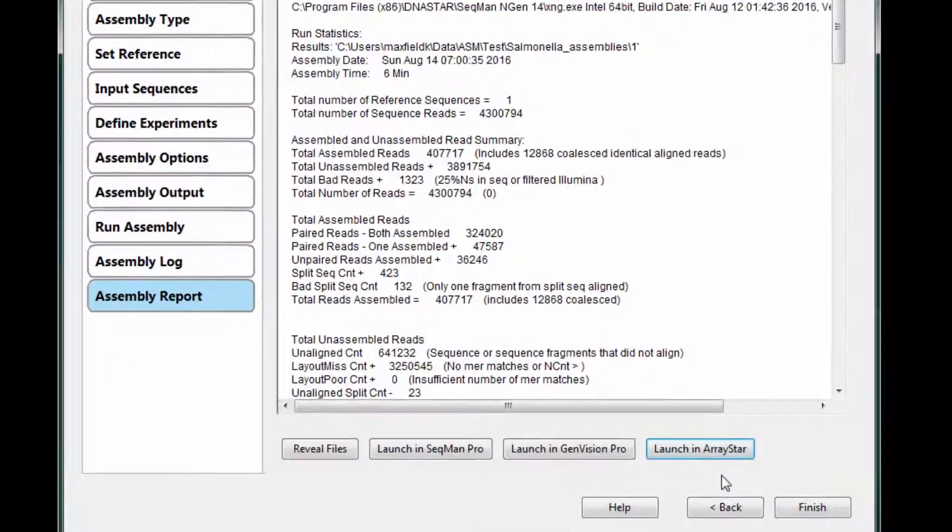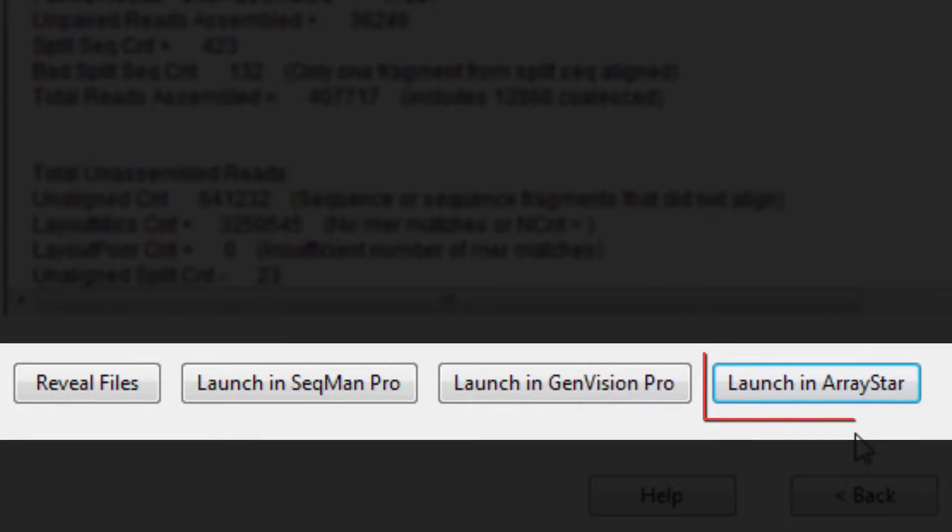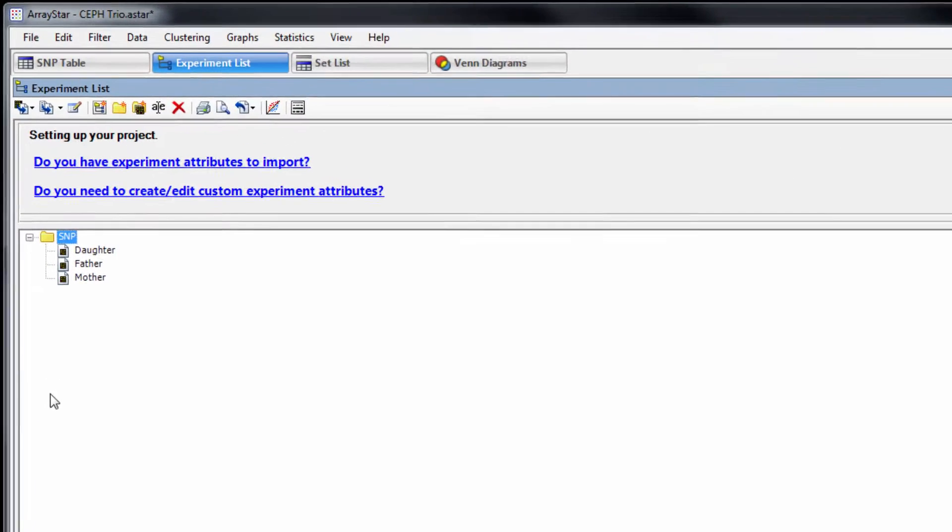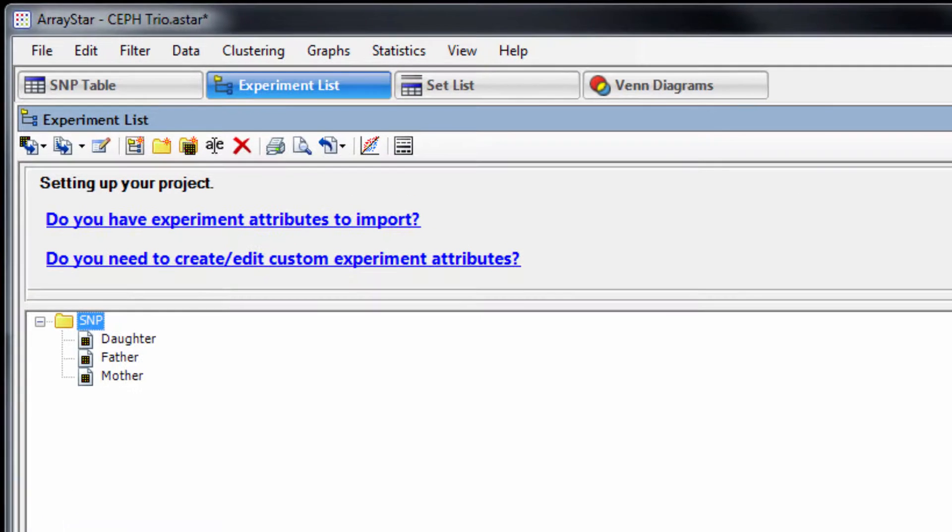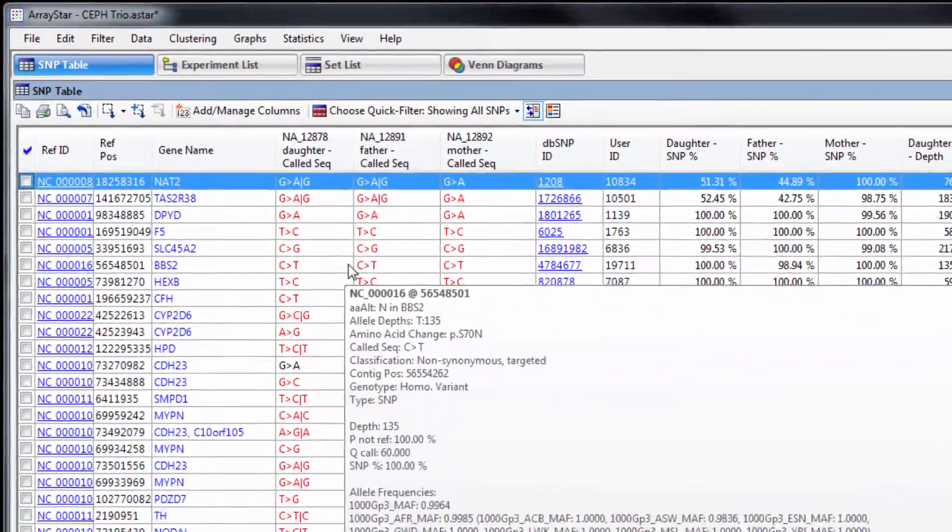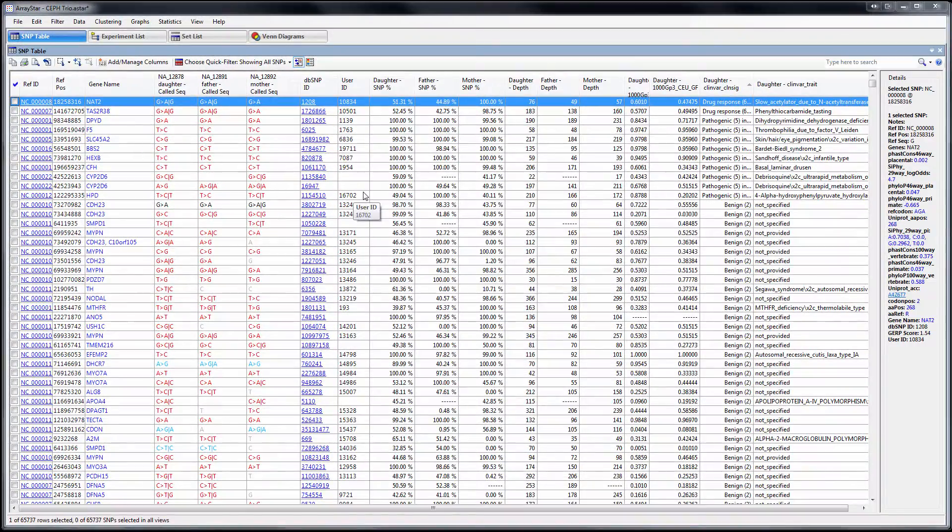Once the assembly is complete, launch the results in ArrayStar to begin variant analysis. Within ArrayStar, each assembly is listed as a separate experiment. If we open up the SNP table, we can now see all variants detected during assembly.